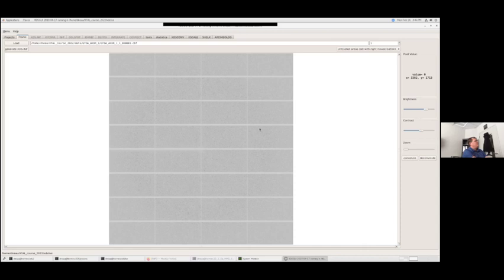So this is only a 0.2 degree angle sweep, and therefore the spots are very small and relatively weak compared to what you see when we were doing snapshots, for instance, during data collection last week, where you were doing 1 degree oscillations with 1 second exposure. These are 0.2 second exposures, 0.2 degree oscillation. So it's going to be very hard for you to see the spots, especially as it's coming through Zoom. I can barely make out a few of them on here.